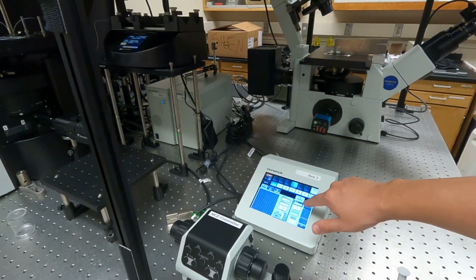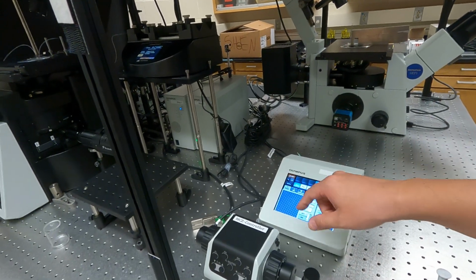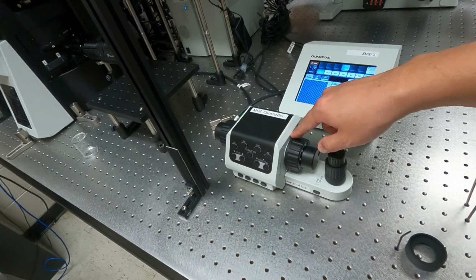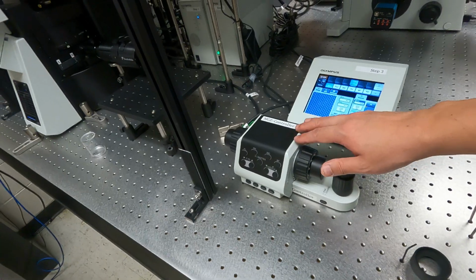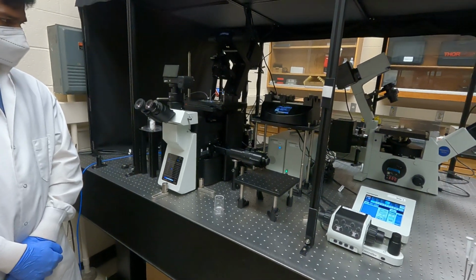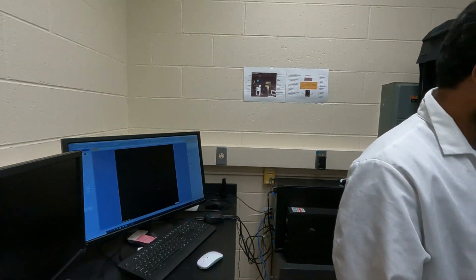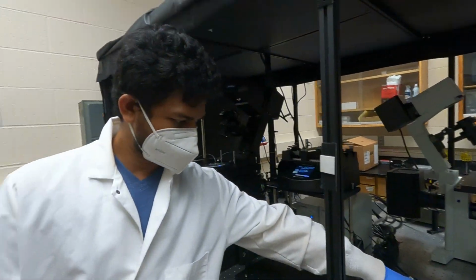So keep an eye on the Z value. If this number is too high, then you need to use the fine adjustment knob instead of the coarse adjustment knob to carefully adjust the focus, the focal plane. That's pretty much all we need to pay attention to before we move to the microscope control. I've already covered that.